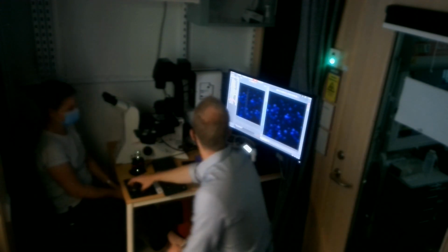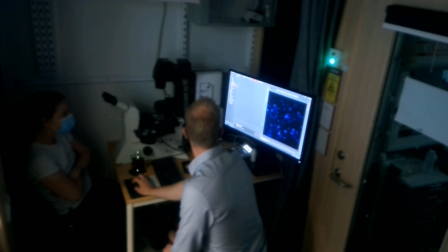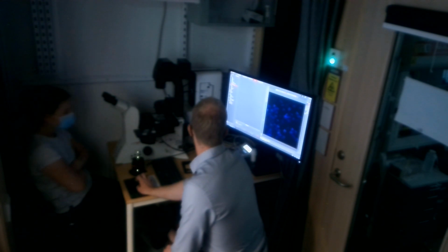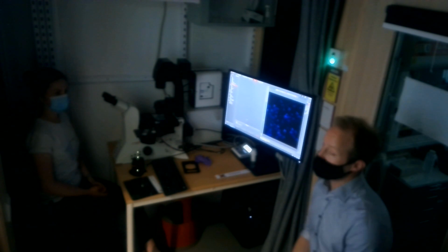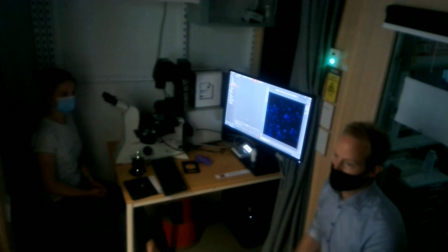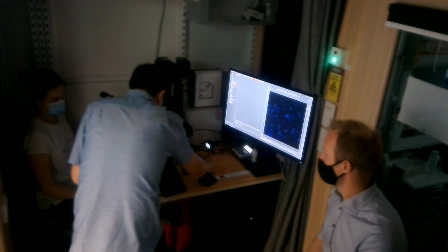Actually, I wonder if the process... Let me have a quick look. There's a license needed for that, but we can test it to see how that would work on something like this. But it's not exactly what you're talking about, because that takes it one more advanced step. This is, I think anyway, a fairly straightforward, basic way of doing it.